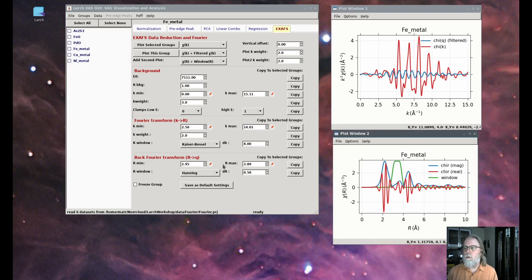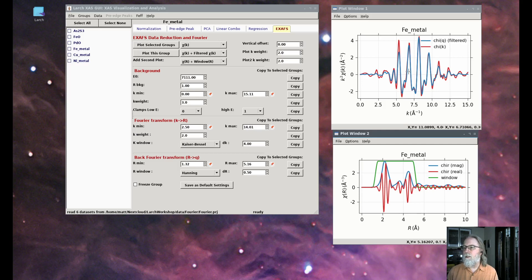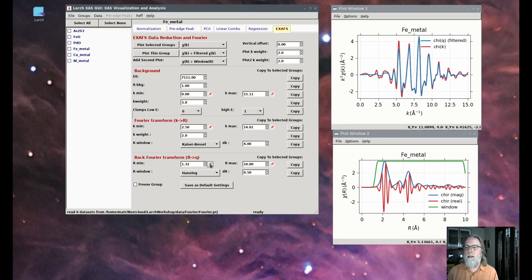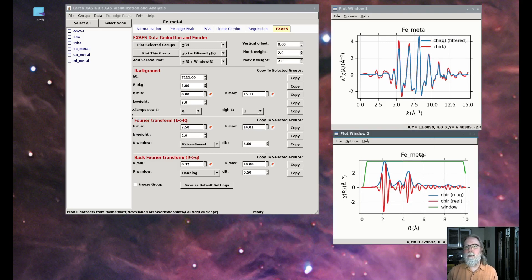If I pick all of these shells together, that pretty well reproduces the data. If I look at everything out to 10 angstroms, that's a very good reproduction of the data. What's left — everything not accounted for — is very small but nonzero, and pretty complicated. It might be hard to analyze those. Also, even at 10 angstroms, for some data sets — especially for strong absorbers, heavy metals — there's actually some intensity that goes past 10 angstroms.